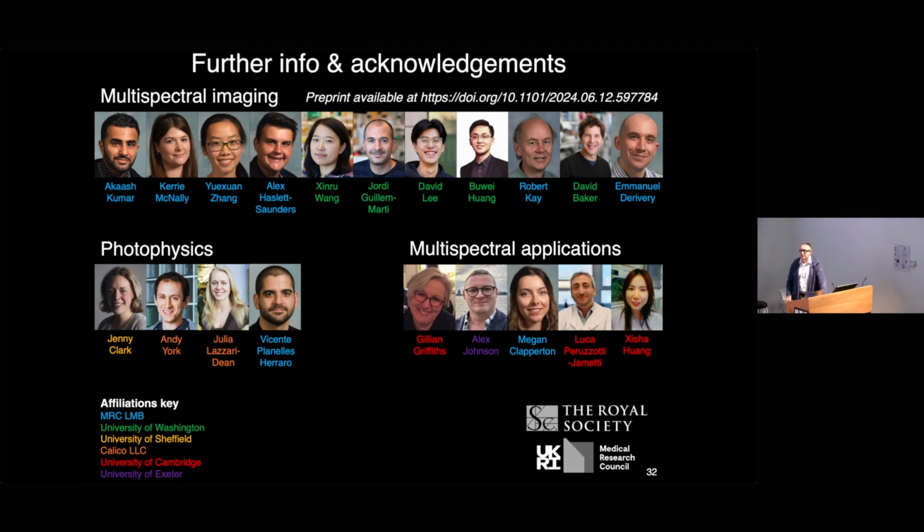So for the best results for GFP, you want about 2 kilowatts per square centimetre, which is pretty high. In terms of thermal effects, because it's spread out over sort of 100 or 200 microns squared, the thermal heating is negligible. And as far as we can tell, nothing absorbs that light directly. So even though you're really blasting it, nothing really responds apart from the GFP, and the GFP responds in a positive fashion. So you can go all the way into getting more signal than less damage? Yeah, so it kind of conks out around 2 kilowatts per square centimetre. That gives you your 4.5-fold enhancement, and then you can turn the laser power up further and you don't get any more signal back.